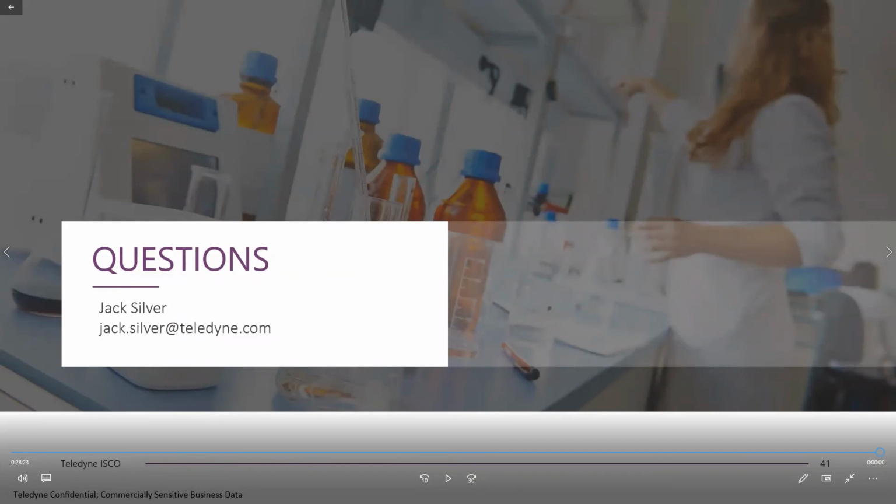Another question is, what if I'm interested in more than one compound? How can we handle this? The zone method won't handle that very well unless both compounds happen to be in the same zone. But the other methods work pretty well. And for the focus gradient generator on the AccuPrep, if the two compounds elute with a difference on your gradient of about 22% B, we can run them on the same gradient in general with a reasonable retention time.